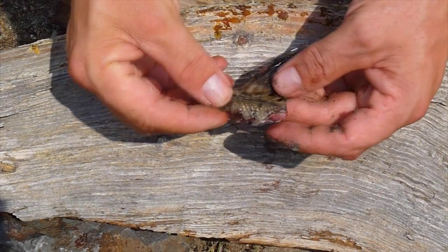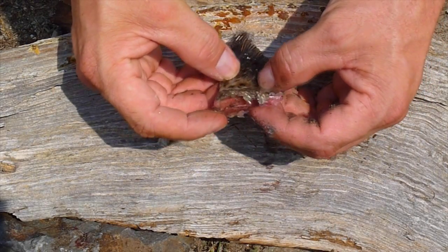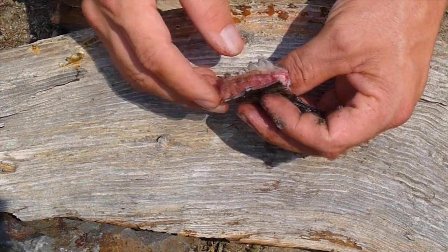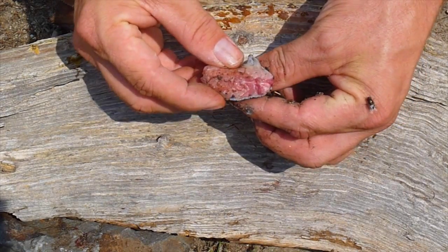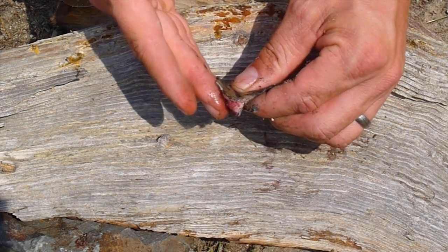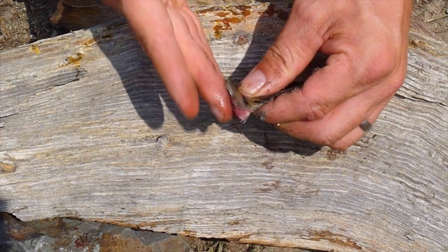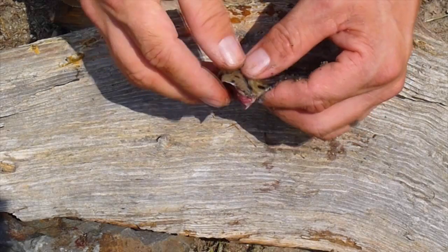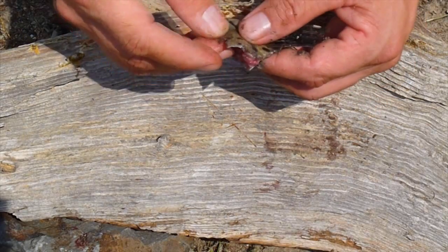This is a dorsal fin that I removed where I went too deep with my cut. You can tell because you don't see the knuckles of the fin rays. Also when you flex it you can see the joint between the dorsal fin rays and the backbone hinging. You know you've gone too deep when that happens.